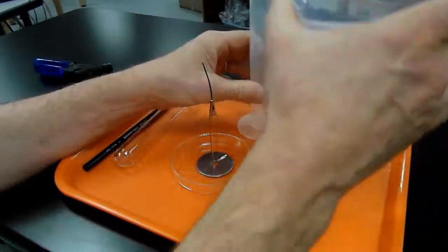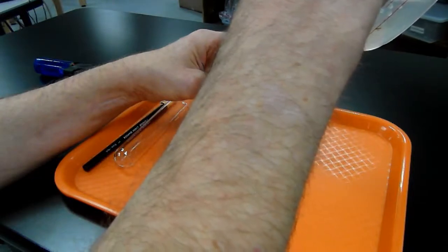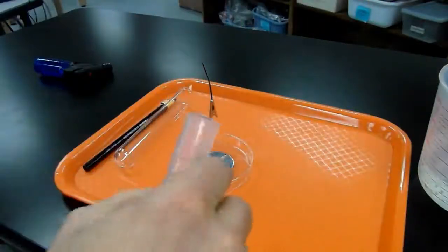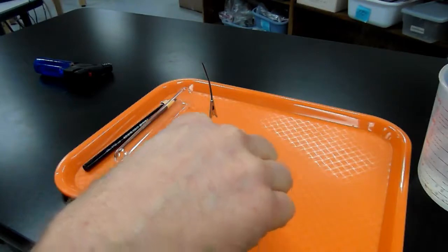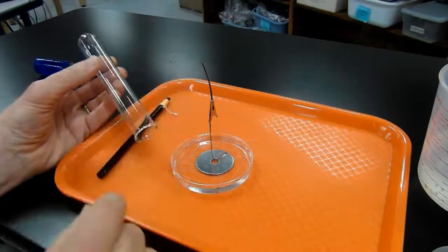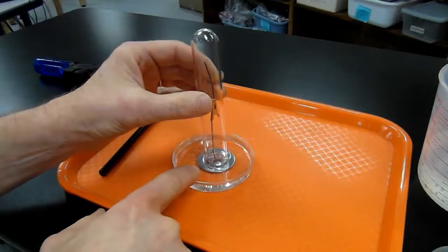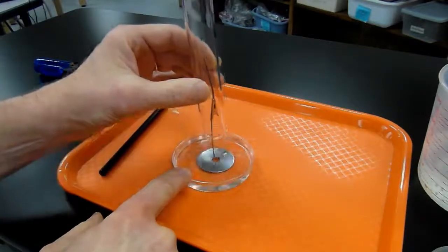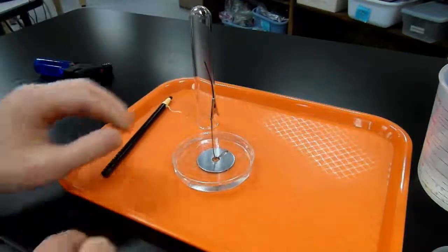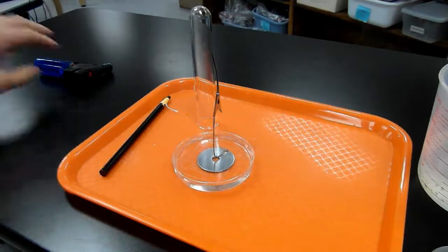We're going to put 50 milliliters of water into the Petri dish base. And then our basic procedure is going to be to light the magnesium ribbon, and while it's burning, we're going to cap it with the test tube and make sure the test tube is submerged in the water. The oxygen in the test tube will be consumed and the water should be drawn up into the test tube. I'm going to try and make that a little bit straighter, more vertical. That looks better. All right, let's do this.